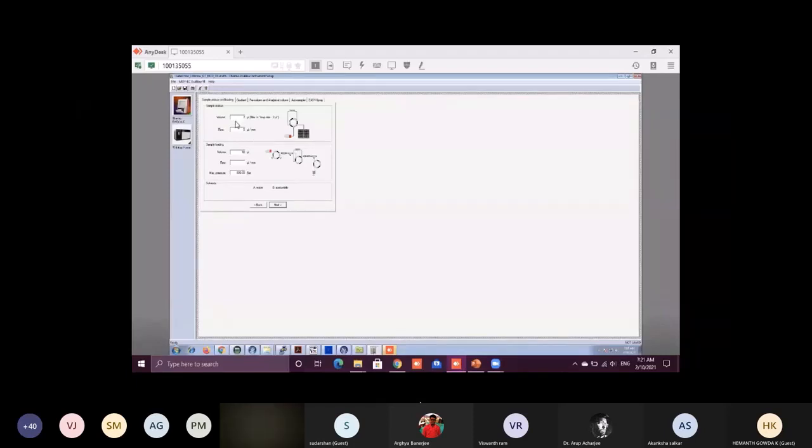Once you have set the method, once you have placed your peptides into the autosampler, the next point is method development. So you have to develop a method for your run. We are using an Orbitrap Fusion for our run and a Thermo nano LC.